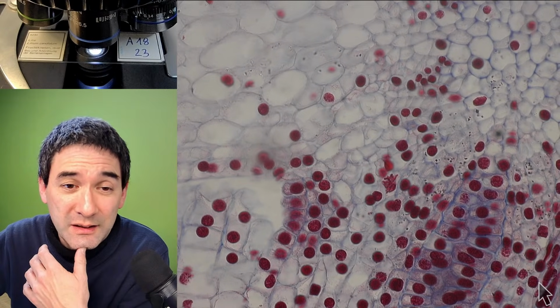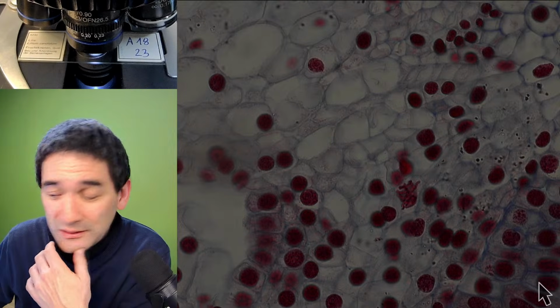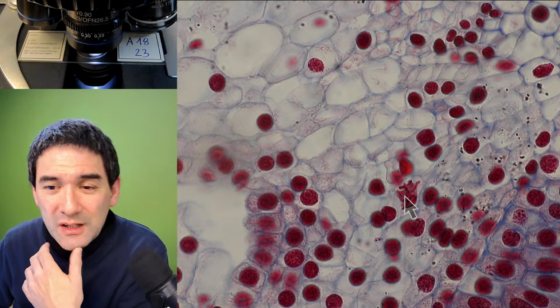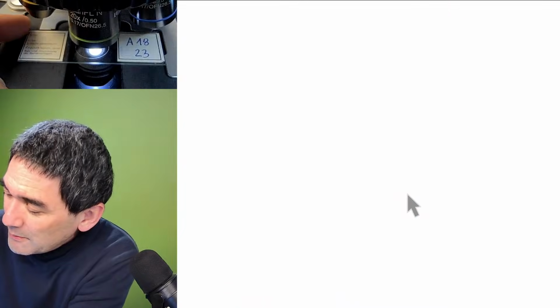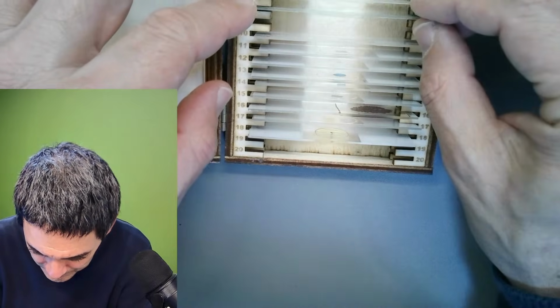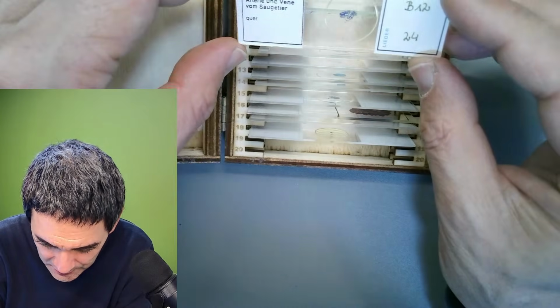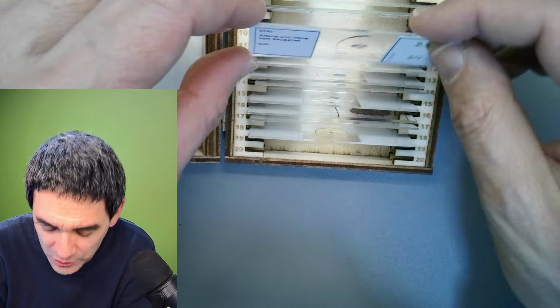Here again in the center, some chromosomes. That's also one of the slides that I like, where I've made some pictures, and then I frame them and hang them up in my room. This takes me longer than I anticipated. Okay, that's a more histological one that I show my students, artery and vein.